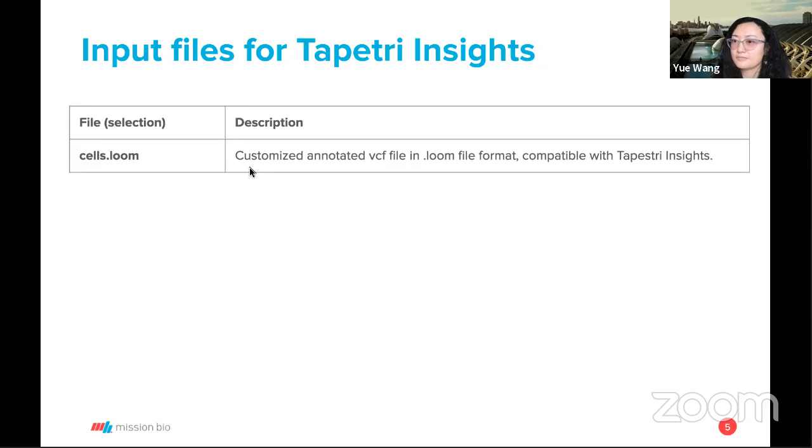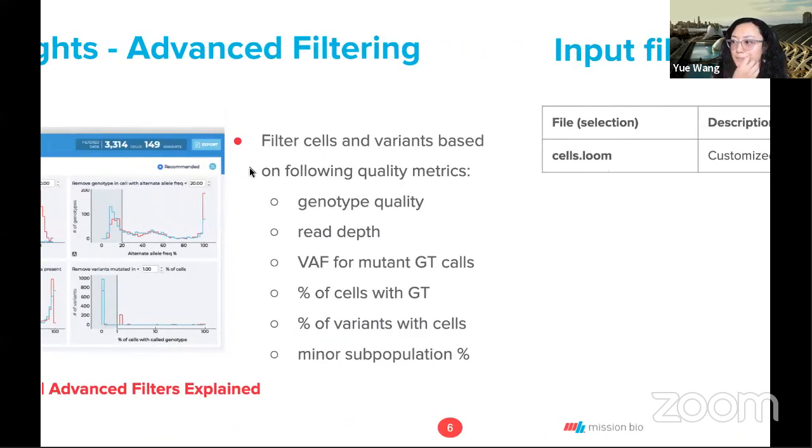As you know from last week's talk, it is the output file from Tapestri Pipeline. So it is essentially a customized annotated VCF file in .loom file format. It is compatible with Tapestri Insights.